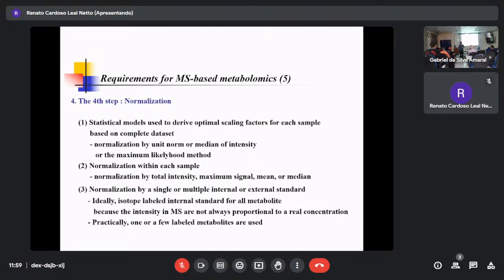Another one: internal standard normalization is very easy to understand. Then there is total intensity normalization. For example, my protocol is using 30 milligram of plant extract, right? But can you trust your balance? Sometimes 30 milligram, sometimes 28 milligram, sometimes 20 milligram. Even if you add the internal standard after extraction, the amount of material is already completely different. Then it cannot be normalized, right?